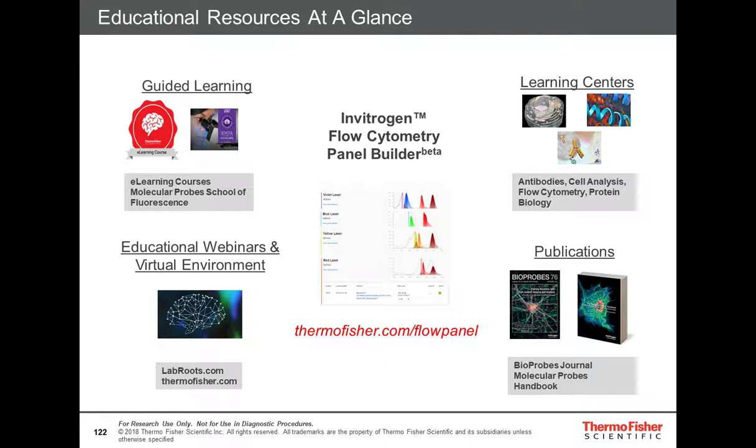Sure. Yeah, you can actually use the papers. There's 2 papers, actually. The one that I gave in the lecture is certainly available. The math in that paper is a little more complicated than I like to do by hand. There is also a paper, I'm going to try and remember it off the top of my head. It's also a Mario Roederer paper and a Marty Bigos paper.